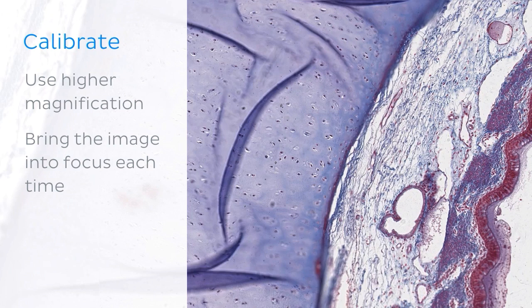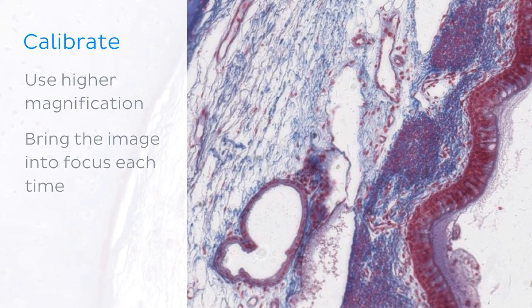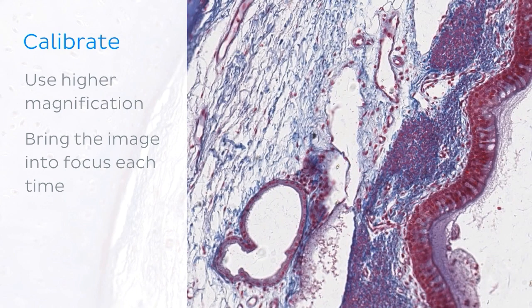It's important to make the image clear at each magnification in order to control which part of the slide you're looking at, especially if you want to zoom into a specific area. It's also important to look at your slide at different magnifications because there can be some major and minor structures or cells that may not be visible at just one magnification. This is as far as we'll zoom in in this example.